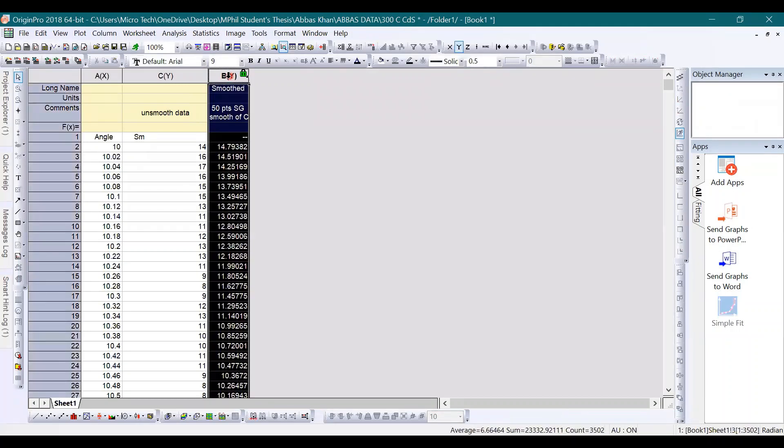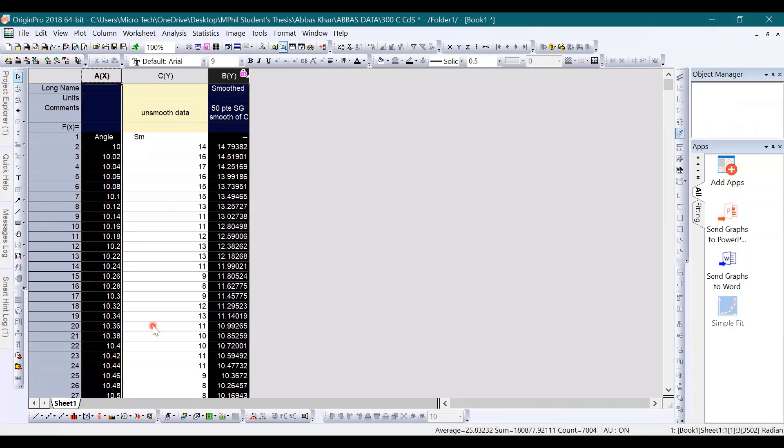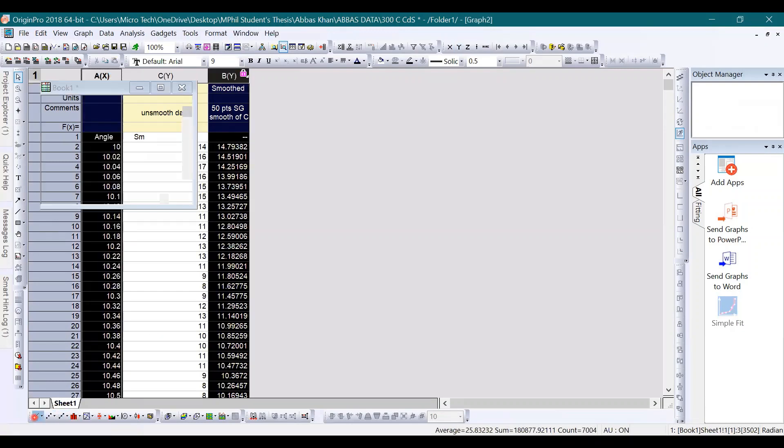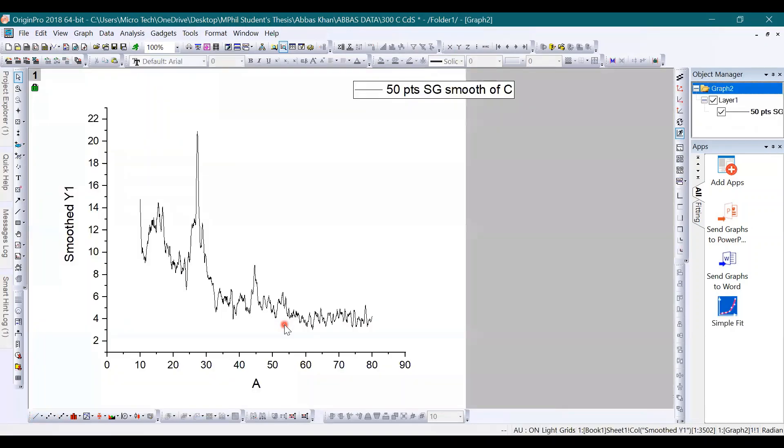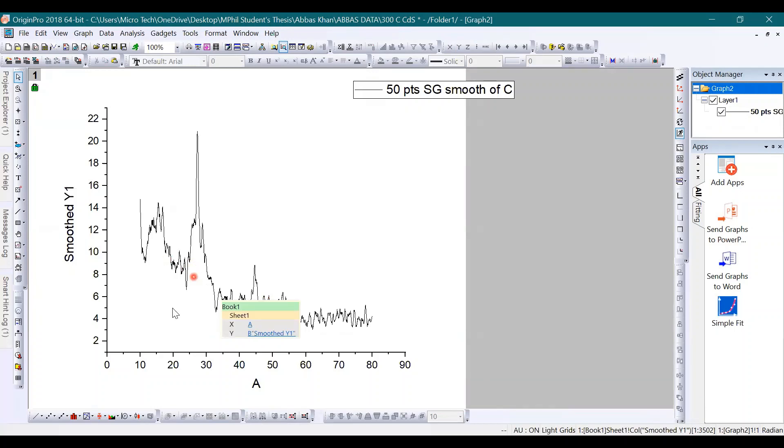Once you have this column, which is the smooth data column, click this and the first column and then plot. Once you click on the plot option, here you have smooth data now. So smoothing of data is done.